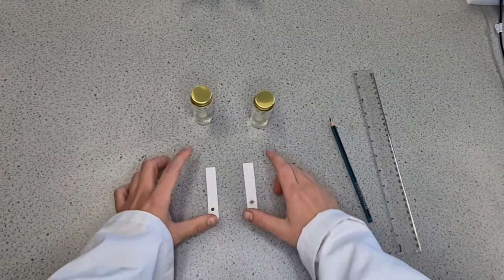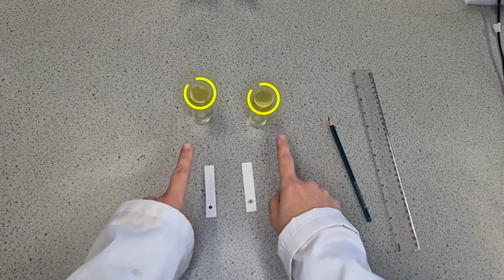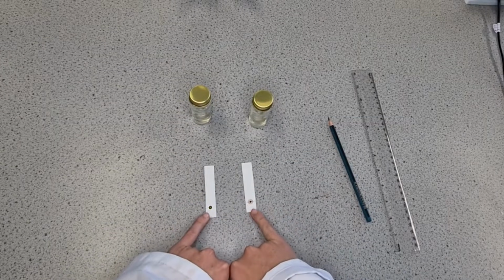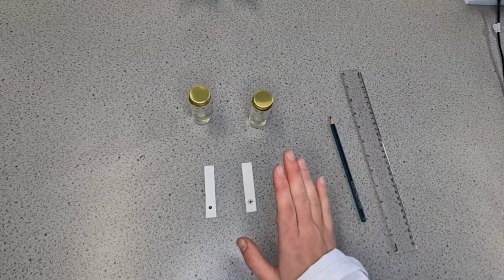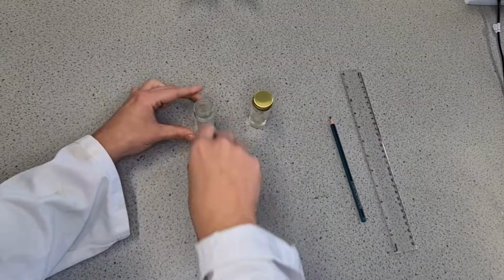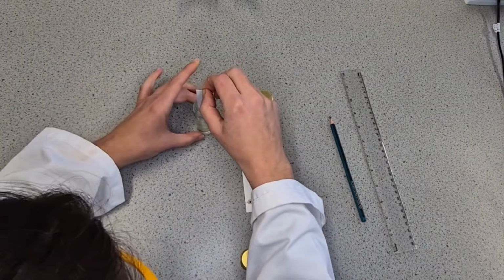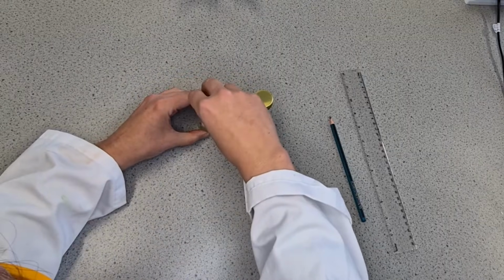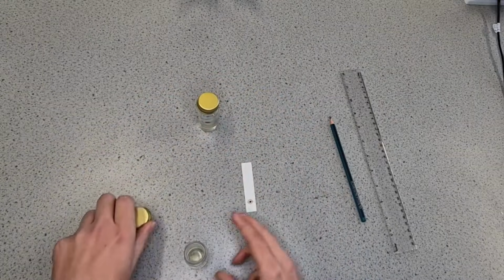So I've now got my 2 TLC papers ready to go into my 2 separate bottles of solvent. I've got my origin line drawn. I've got my pigment above where the solvent is going to reach. And then I've got my pencil and rule at the ready to take it out afterwards. So we need to make sure that we are lowering it in vertically. And I can see that the solvent was below the pigment line, so that's good.